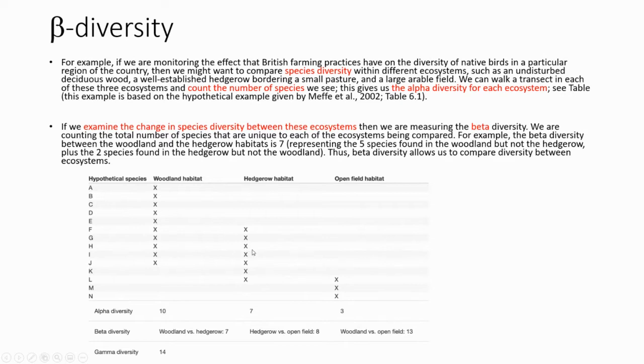This kind of analysis is called beta diversity.